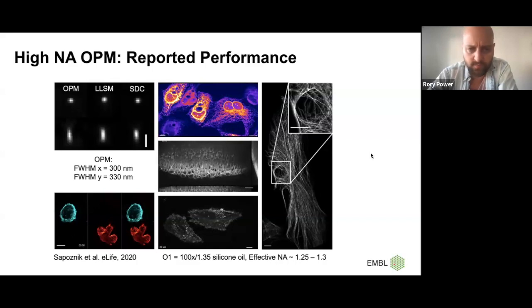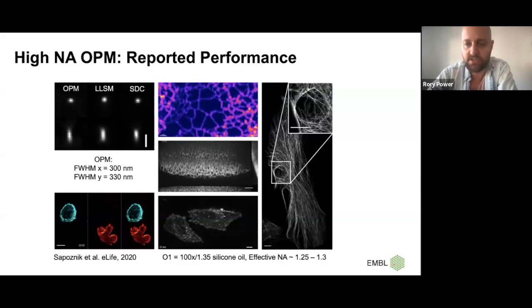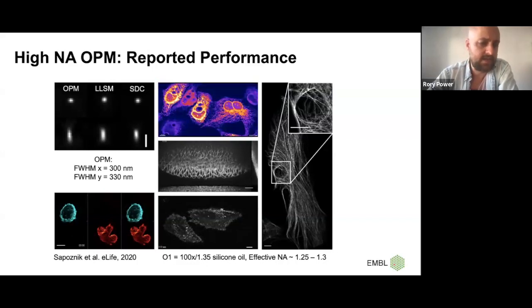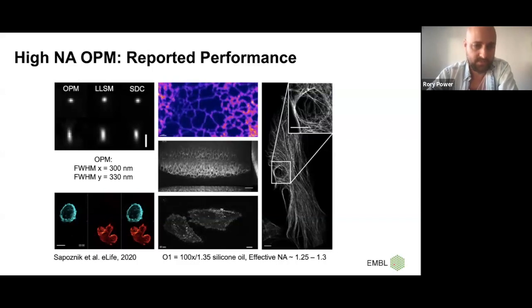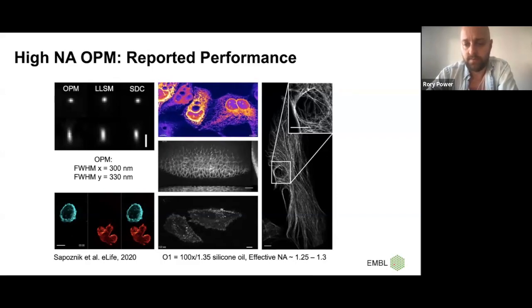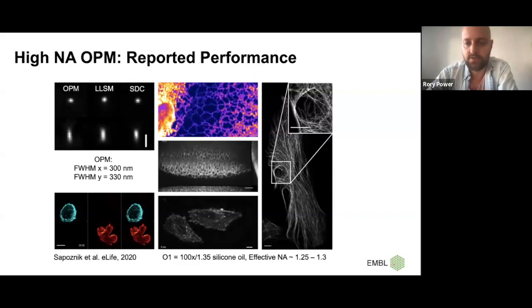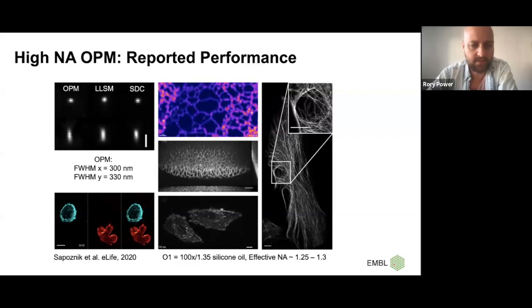So the question was, is this something we could reasonably implement for service at the imaging center? I'd say yes, clearly, but there are obviously a number of challenges. I think Alfred and Andy had done a really nice job of putting out, with their preprints, a lot of optical designs and so on. But beyond that, there wasn't an awful lot of information on how to build something like this. So as anyone would, I designed the whole optomechanical scheme, also the control software and electronics and so on, from scratch. So I'll show you the design we came up with.